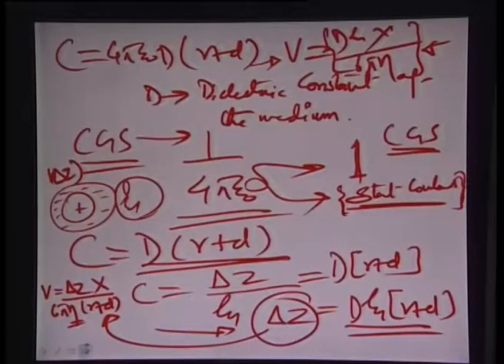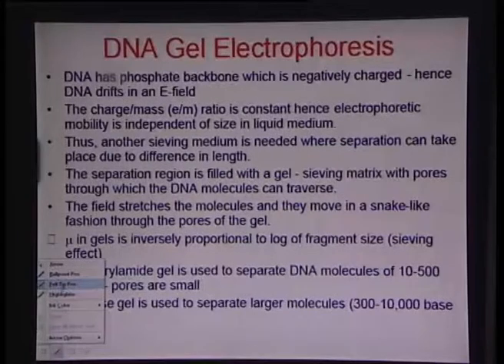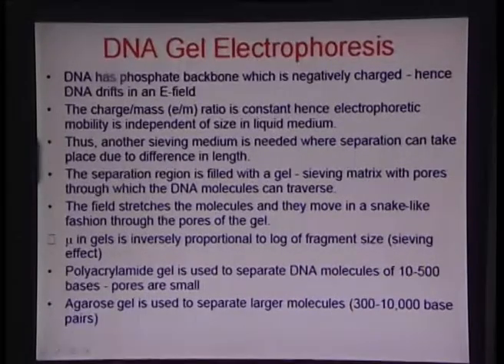We now go into the practical aspects associated with this electrophoretic process. Essentially, electrophoresis is very widely used for fractionating DNA molecules, as I have already suggested before, especially using sieving matrices with a series of nano level channels, or at least channels which are 100 nanometers or more in diameter across the matrix, and these are essentially gel materials.